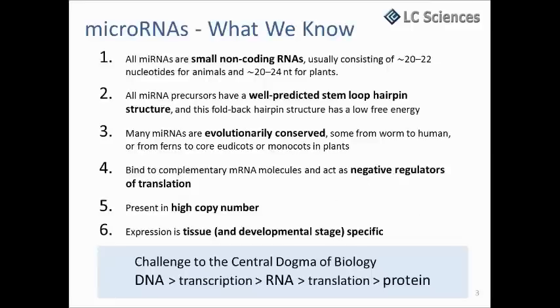So today's topic is degradome sequencing for plant microRNA target identification. For this topic today, we are going to first give a simple introduction about microRNAs in plant. And then we will explain a little about target identification. Then, most important, we want to introduce degradome sequencing to everybody. And we will show some case studies. The last one, we're going to try to answer a question.